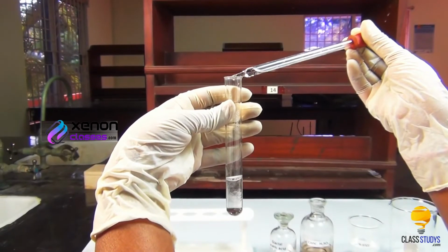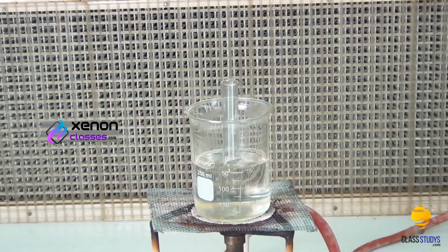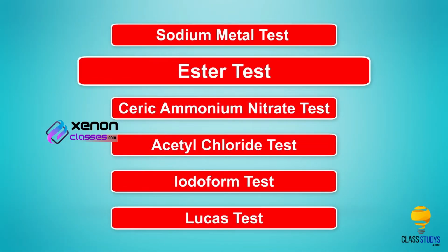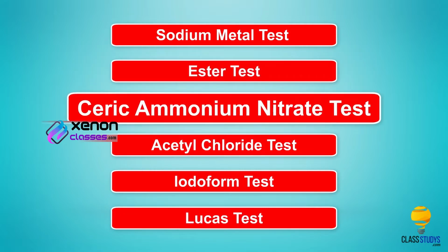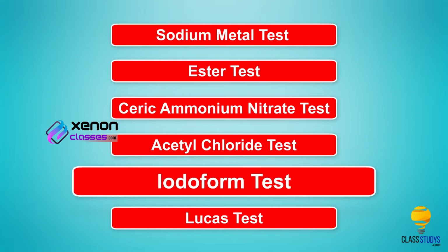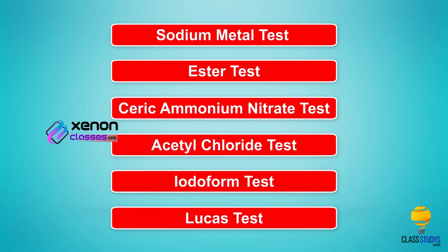Our aim here is to identify alcohols using some simple tests. They are sodium metal test, ester test, ceric ammonium nitrate test, acetyl chloride test, iodoform test, Lucas test.